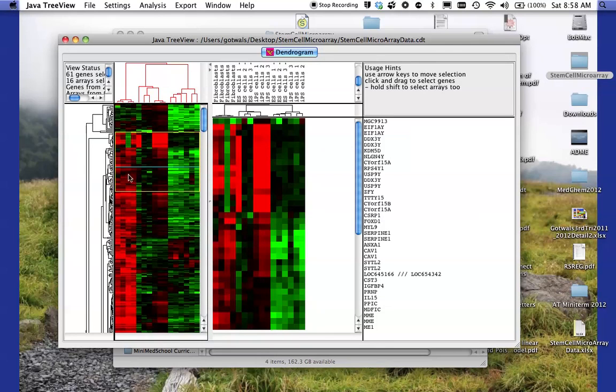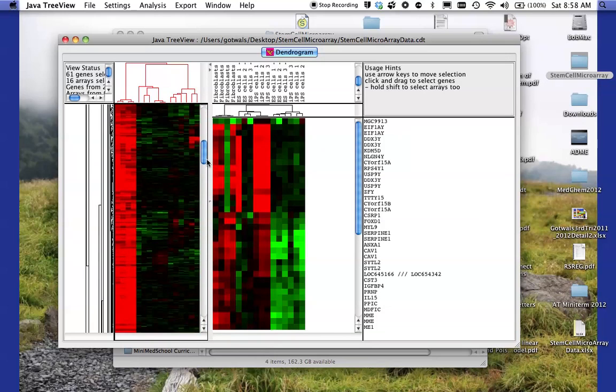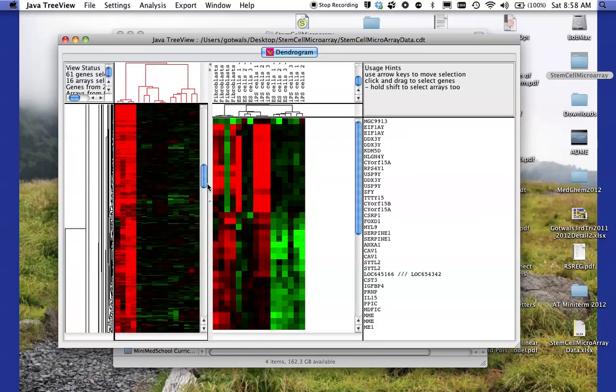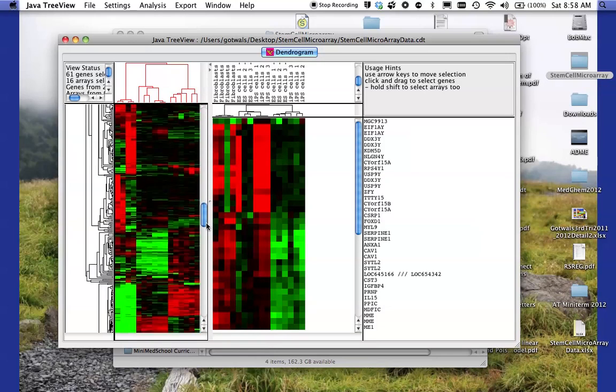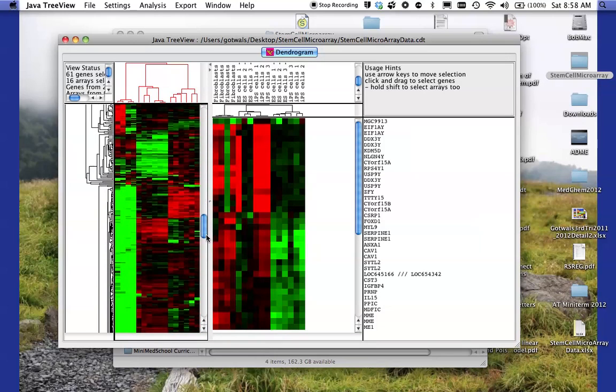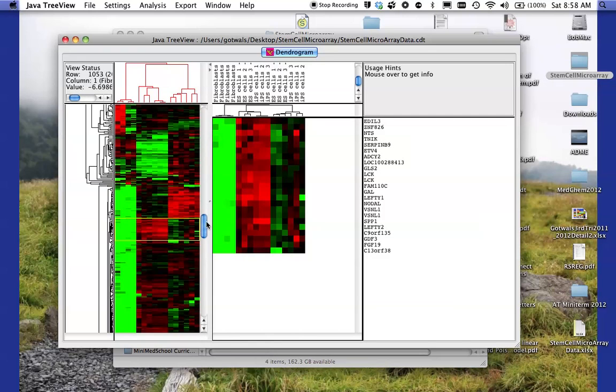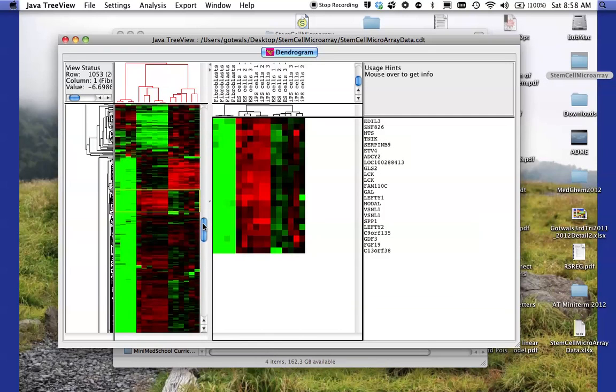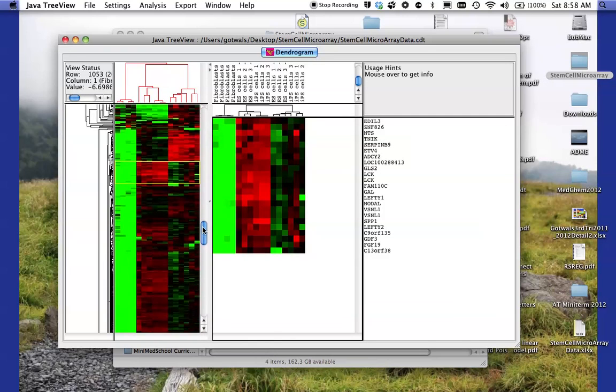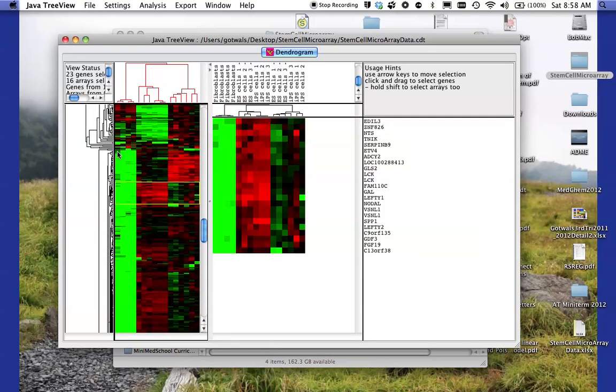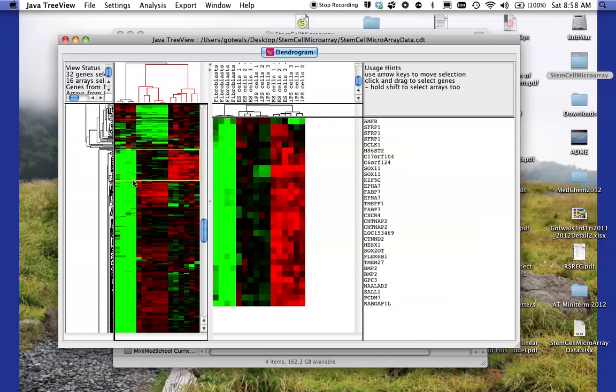So again, I can sort of zoom in. If I scroll down here, if I find an interesting area, I might come down here. Oh, there's a lot of red here in this particular area. So I can sort of zoom in on that area and see all the genes there. These are the ones that happen to be highly expressed in the embryonic stem cells. So I can zoom in on particular areas. Here's an area right here that it looks like they're highly expressed in the IPS genes and some in the ES genes. So I can see all those genes that are in that particular list.